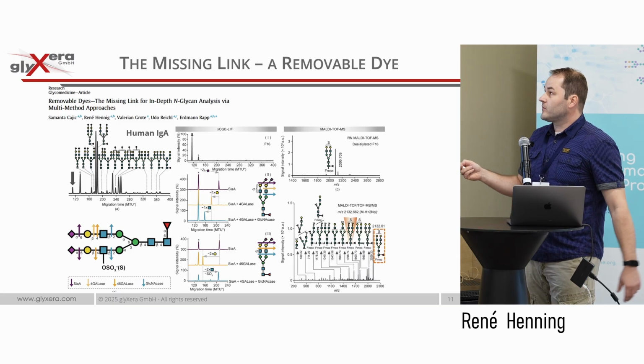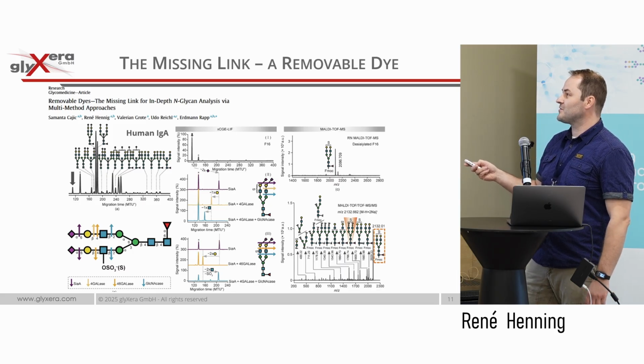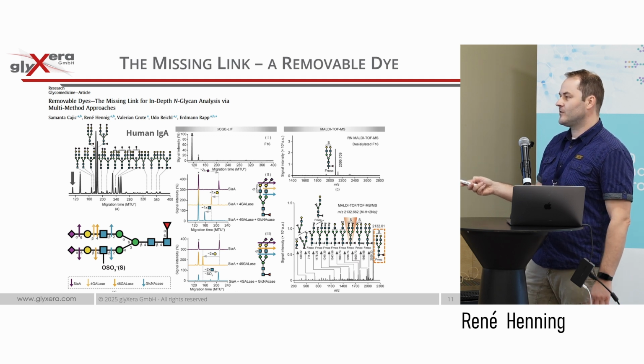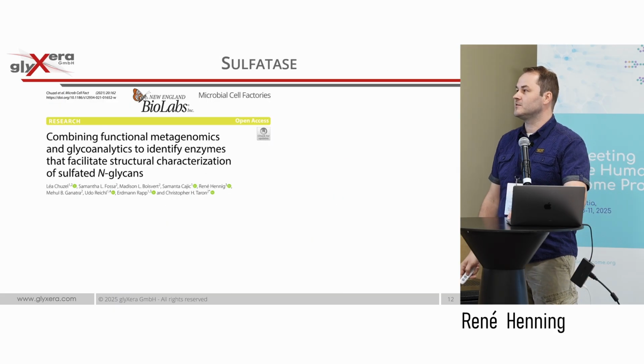And of course, we also went to MALDI, otherwise nobody would believe us. The FMOC label, we could get a MALDI spectra. It was not easy, you need a lot of sample. And we also got an MS spectra, so everything was publishable, and we published it, and it was great.